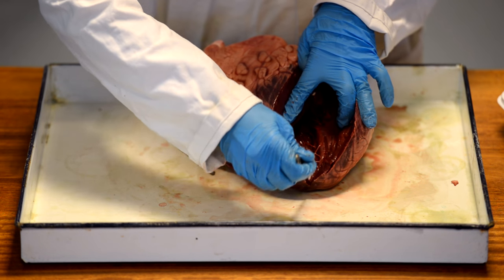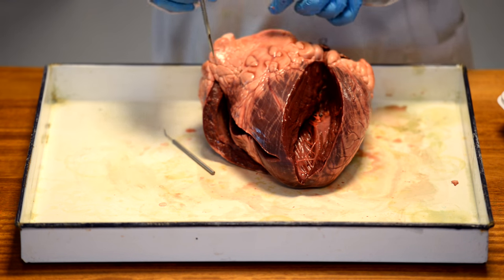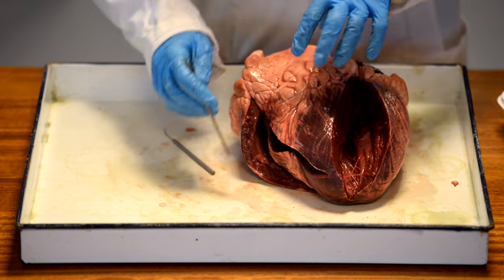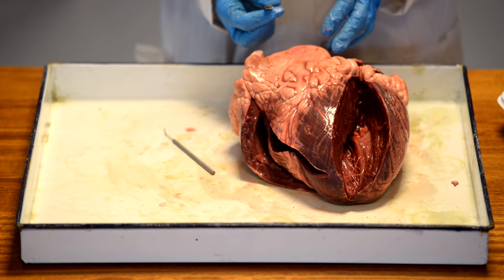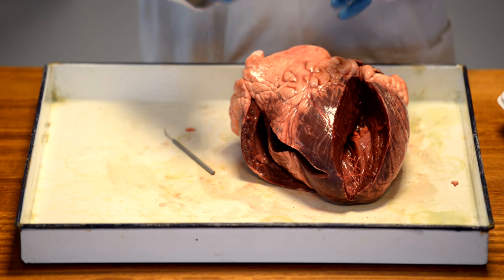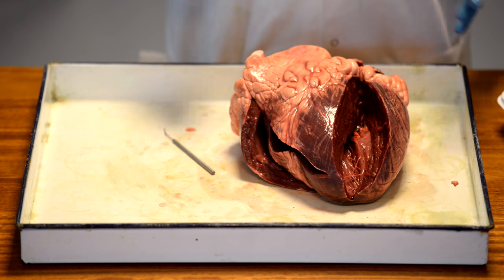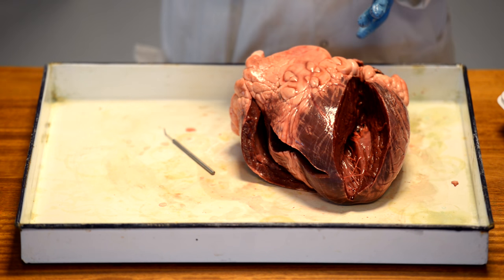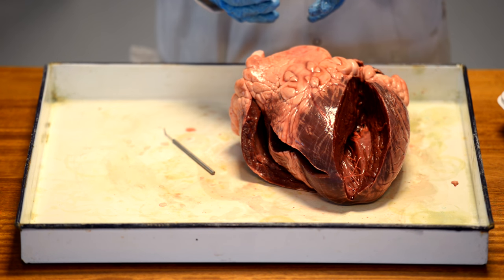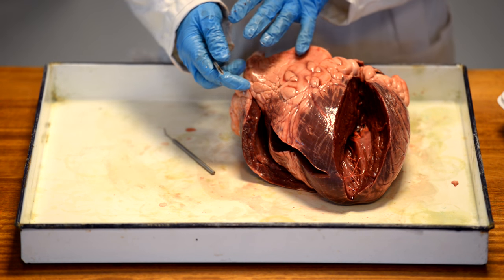So why has this side got such thick muscles and the other side got thinner muscles? This side, the right-hand side, is only pumping blood to the lungs. If it had the same pressure, your lungs would instantly fill with fluid in between each beat of your heart. So you can't afford to have that pressure going into such a delicate organ as your lungs. So this side beats with less pressure.